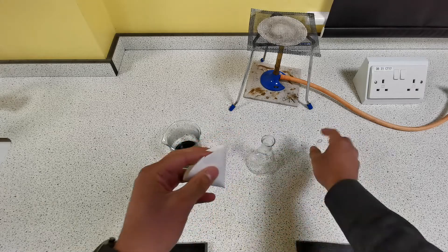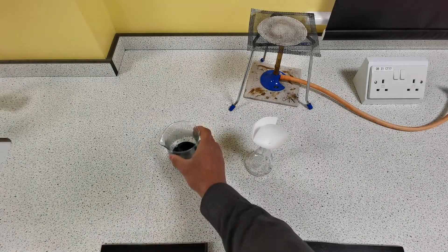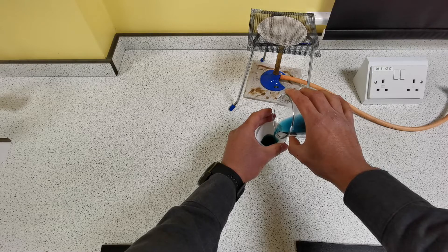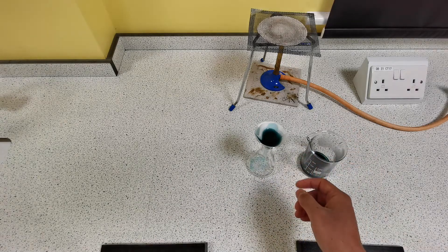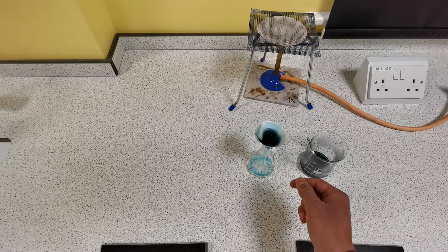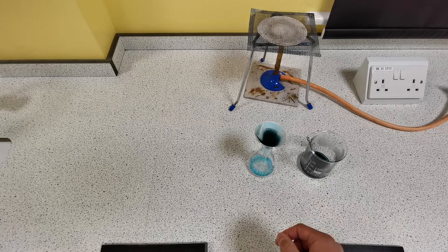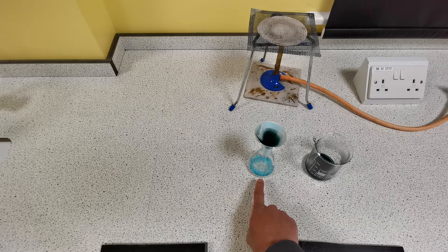The cone fits into the filter funnel, which will go into the conical flask. Slowly pour the mixture into the filter paper. The copper sulfate dissolved in water has particles small enough to fit through the holes in the filter paper, so it will be collected in the bottom as the filtrate. The copper oxide powder is too big to fit through the holes, so it will remain on the filter paper as the residue. Keep adding your mixture until you've collected your copper sulfate in the bottom of the conical flask — as you can see, it's a nice blue.